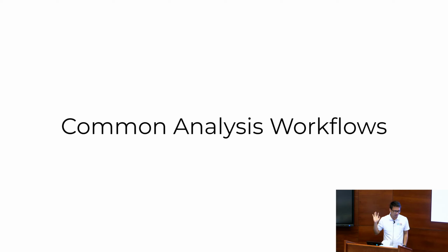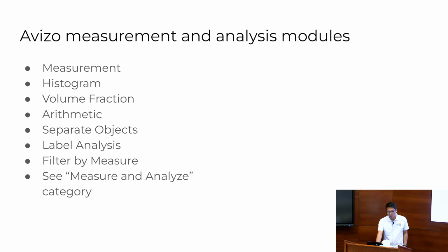And we've seen how to use Avizo's basic tools for segmentation, the AI tool for segmentation, Ilastik's neural network classification, and Ilastik's pixel classification. And let's say now you have your segmentation data, what can you do with it, right? Because in the end, you want something that you can put in your paper, right? So there's a question you want answered, and the segmentation is usually just a means. What you want to do in the end is to apply some measurement or analysis, okay?